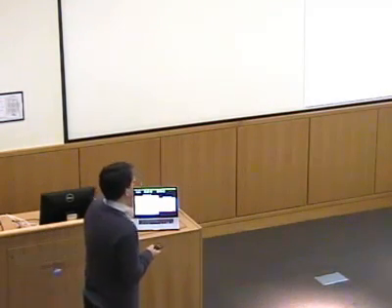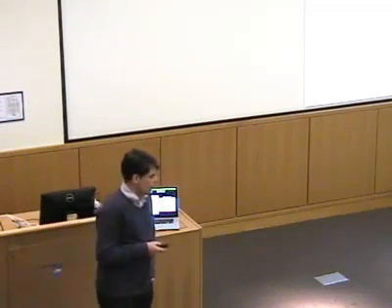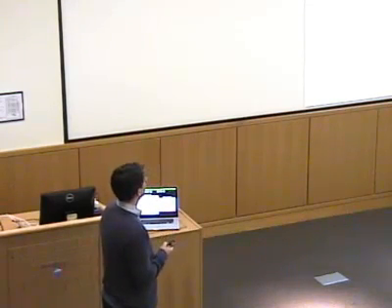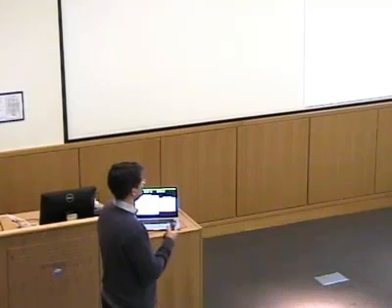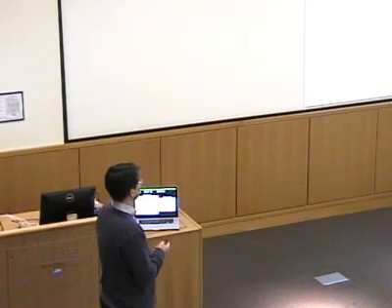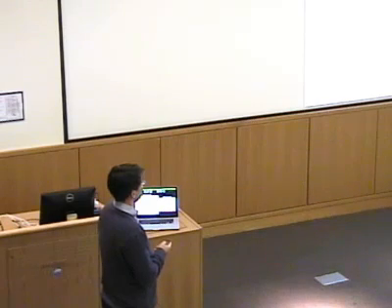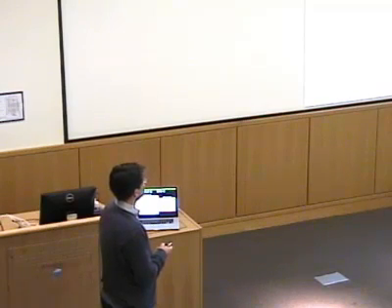Now, the experiments for IR spectroscopy and Raman spectroscopy are fairly different. IR spectroscopy, on the simplest level, you can think about it just like an absorption experiment, just like your absorption spectrometer, just with infrared radiation. So you have an IR light source, you have a sample cuvette, a reference cuvette, you have an IR detector, and then the signal goes to the computer, and using the Lambert-Beer law, the infrared absorption is minus the logarithm of the intensity of the detected radiation divided by the reference intensity, and that equals the extinction coefficient times the width of the cuvette times the concentration of the species.